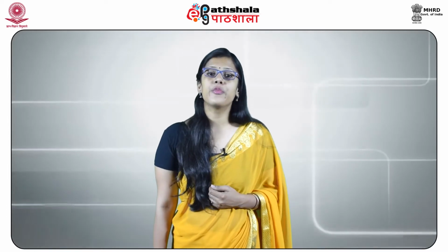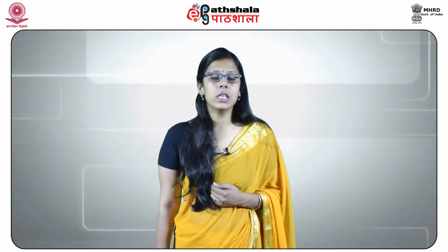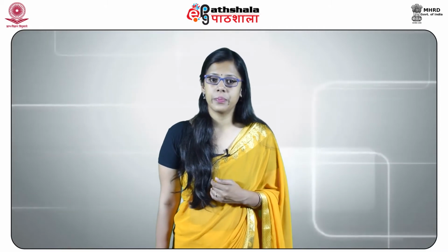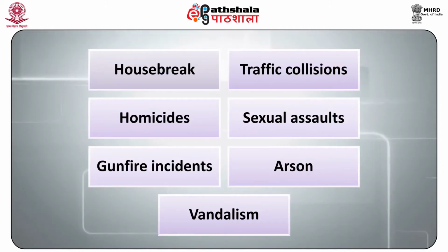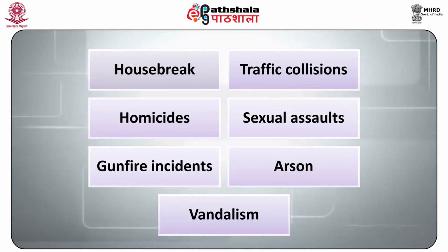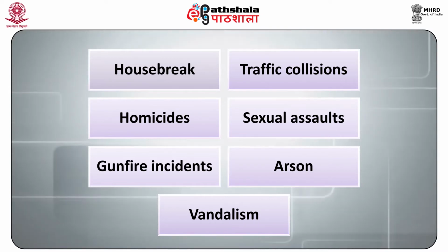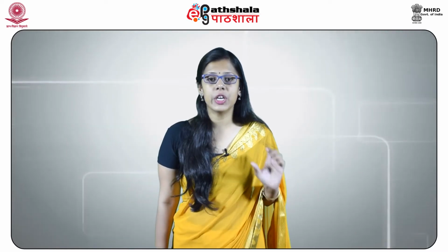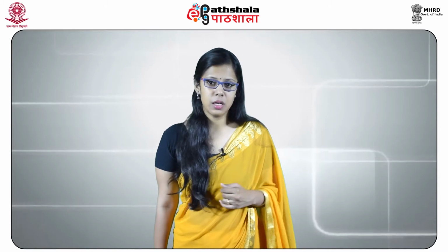Now let us move on to physical division. In physical division, we have the refractometer. Glass as physical evidence is repeatedly encountered in a number of crimes such as housebreaking, traffic collisions, homicides, sexual assaults, gunfire incidents, arson and vandalism. Glass forms one of the evidentiary materials in many criminal cases.